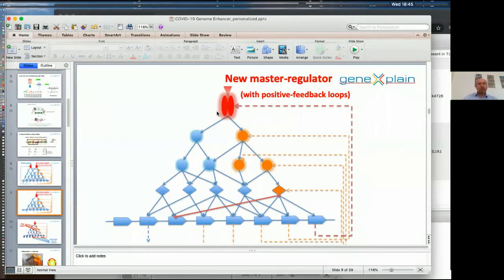In order to add statistical significance to our search, we apply a certain scoring schema. We calculate a score for each master regulator, and this score is proportional to the number of transcription factors it can regulate, and it is downgraded by the number of other transcription factors which are not involved here, which can also receive signal from the master regulator.